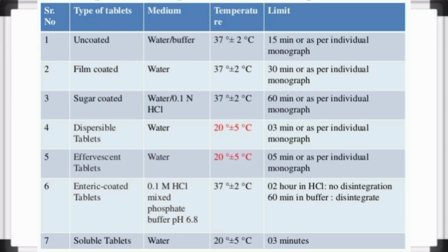Uncoated tablet 15 minutes, film-coated tablets 30 minutes, sugar-coated tablets 60 minutes, dispersible tablets 3 minutes, effervescent tablets 5 minutes, enteric-coated tablets 2 hours in HCl no disintegration, 60 minutes in buffer disintegrate, soluble tablets 3 minutes.